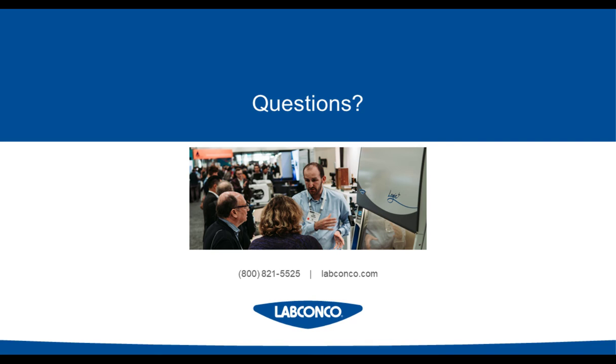And speaking of filters, one audience member wants to know, why does a HEPA filter have an expiration date? Great question. HEPA filters have a very long lifetime, especially when treated nicely. They're made out of borosilicate, inert glass as a media. But they contain a gasket that is required to seal that entire filter frame to whatever the application might be, whether it's in a clean room sealing or a biosafety cabinet's internal airflow plenum. And that gasket is the failure point for a HEPA filter.